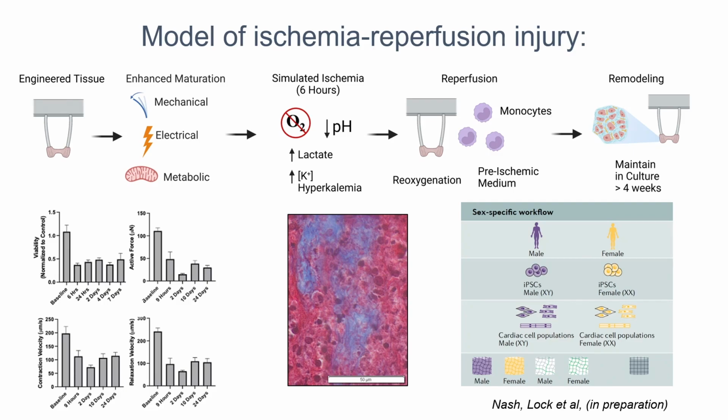We also included into these studies sex-specific studies, so we are looking into differences between males and females that are known to exist. And this actually turned out to be major effort because we were discovering that many of our culture media contain hormone-like substances, so we had to develop new culture media that are hormonally neutral so that we can introduce the hormones. So it's not only genetics, male, female, it is also the presence of the right hormones that we are now studying.